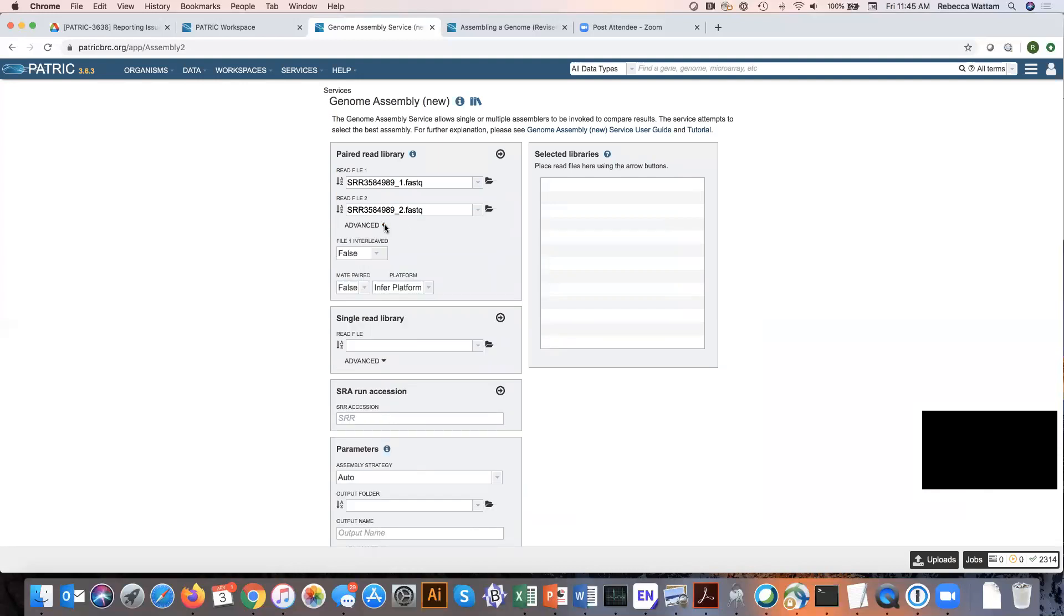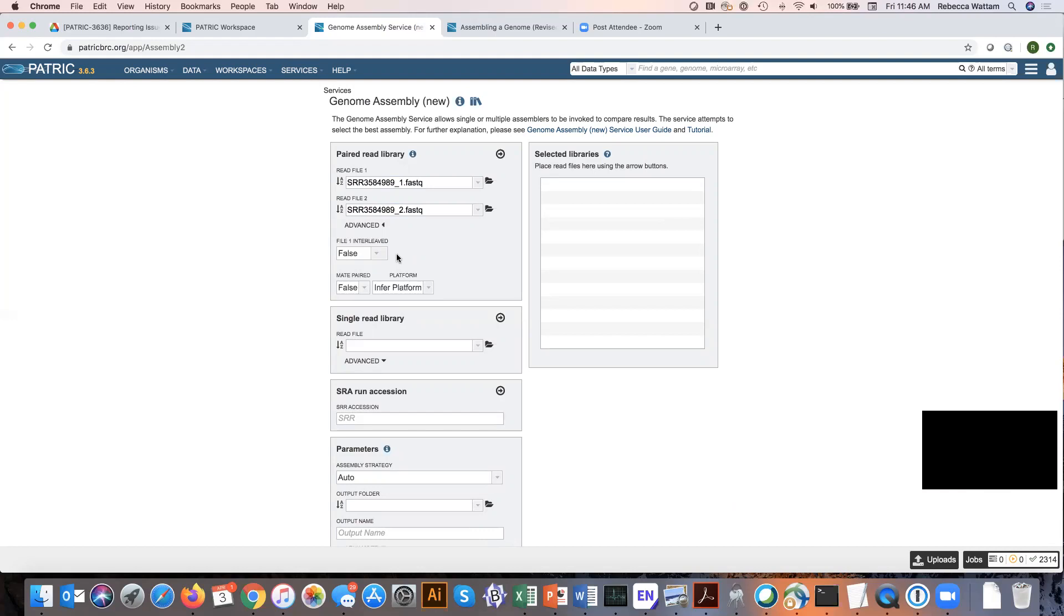One for interleaved, one for mate pairs, and one for platform. What is interleaved? Interleaved files occur when the R1 and R2 reads are combined in one file, so that for each read pair, the R1 read comes immediately before the R2 read, followed by the R1 read for the next pair, and so on.